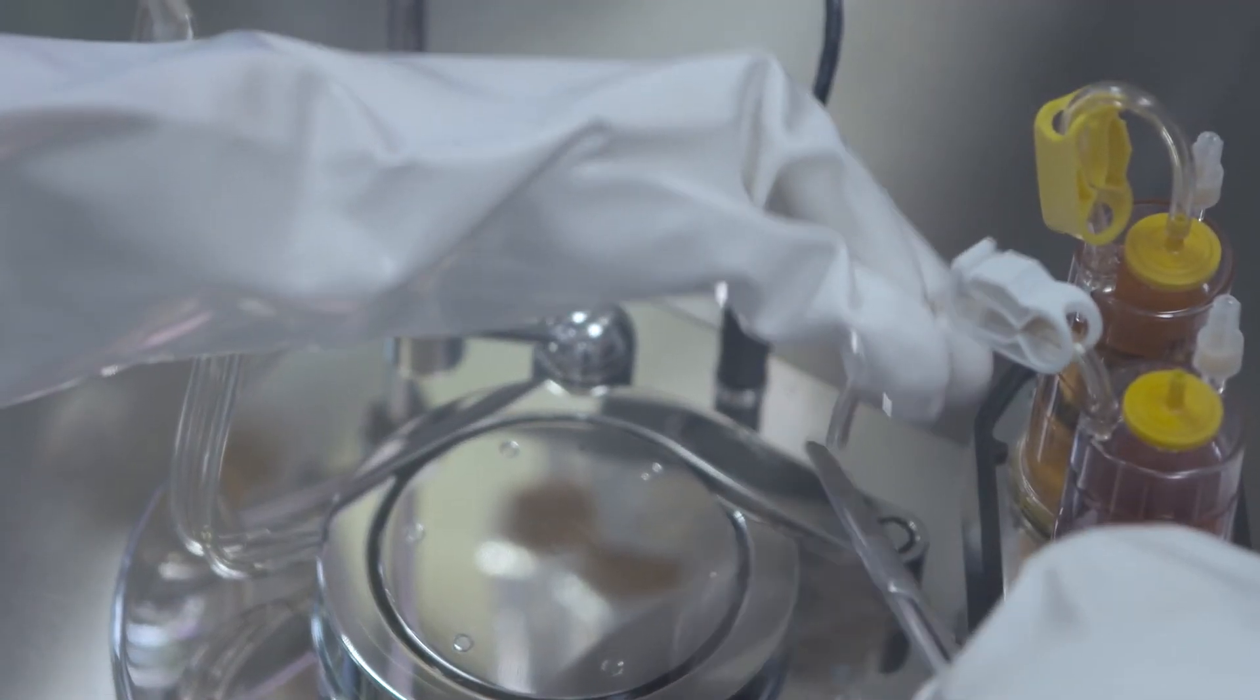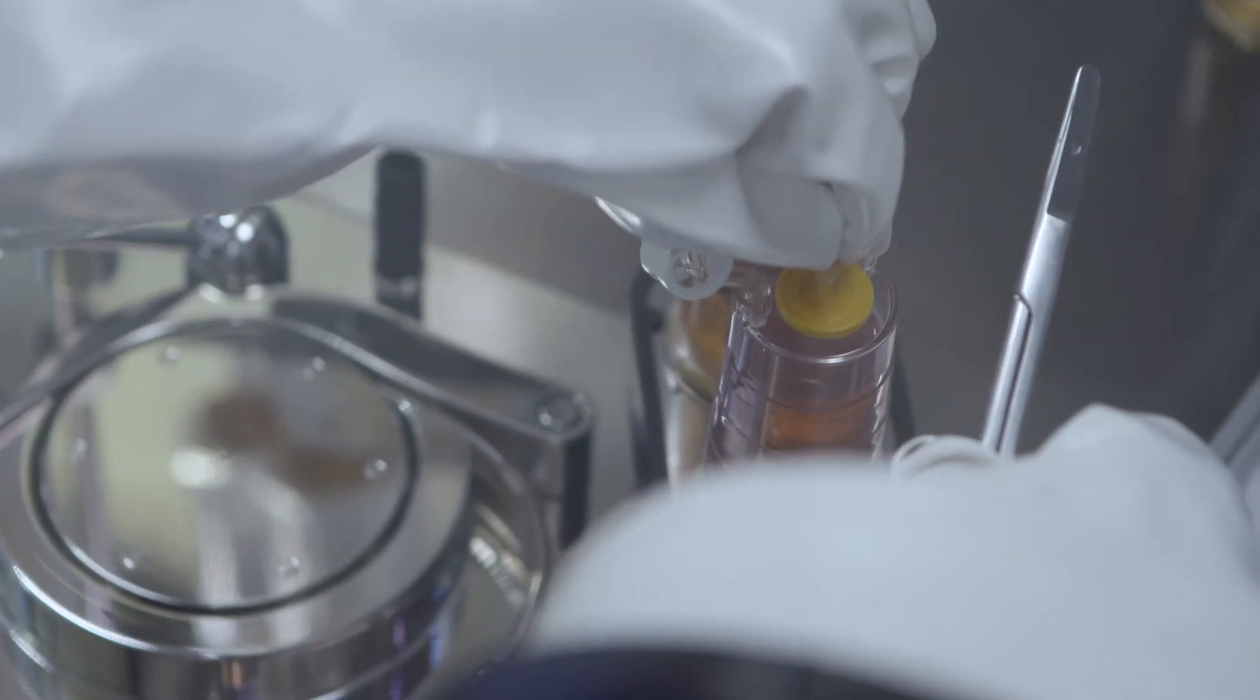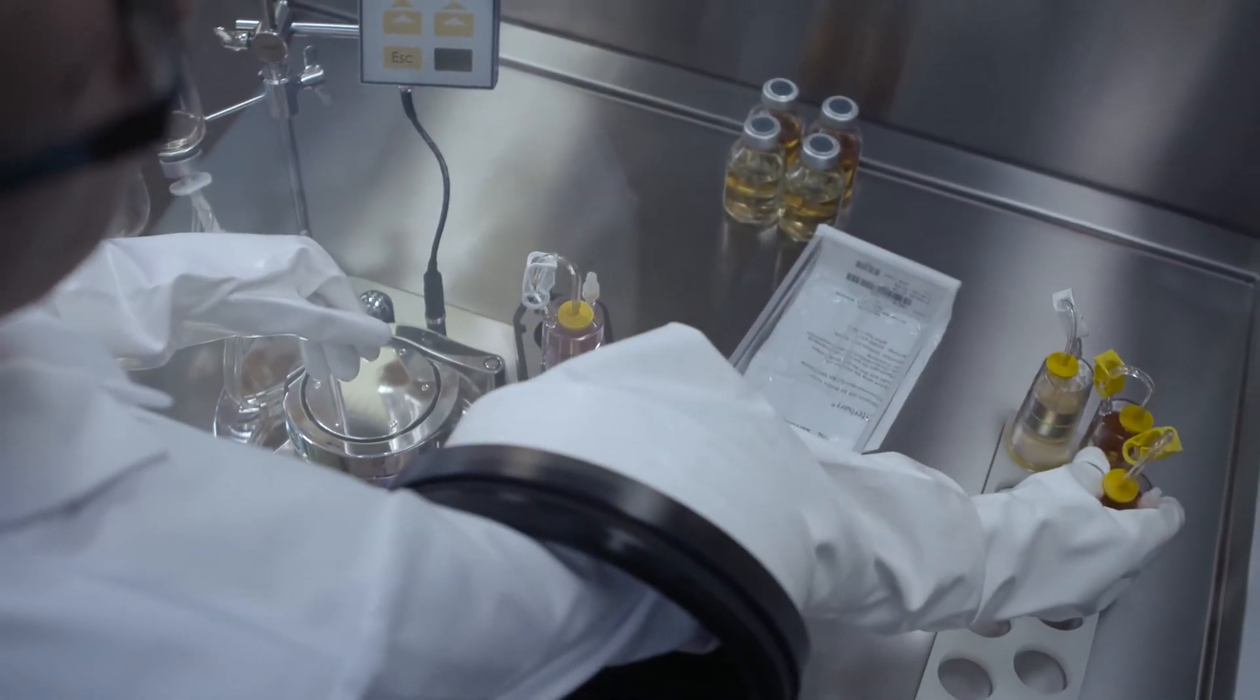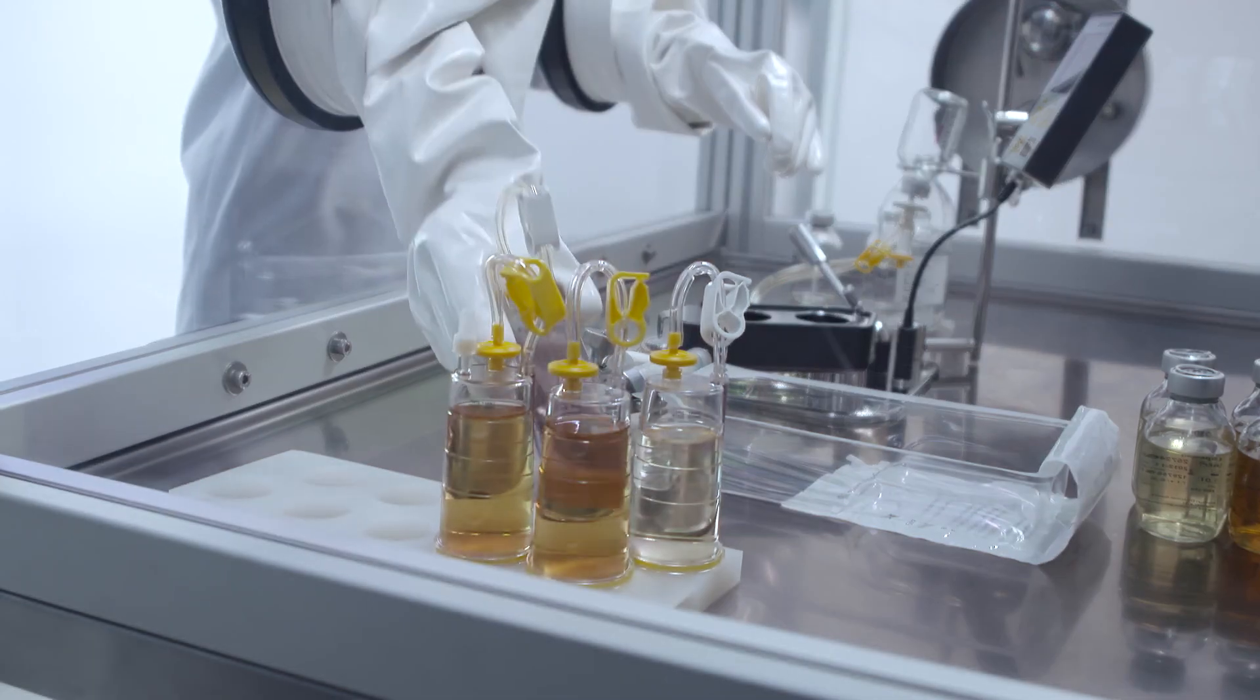After rinsing, the filtration units are filled with culture media and incubated for 14 days. A mere visual check will then allow you to assess whether your product is compliant with the International Pharmacopeia and can be released or not.